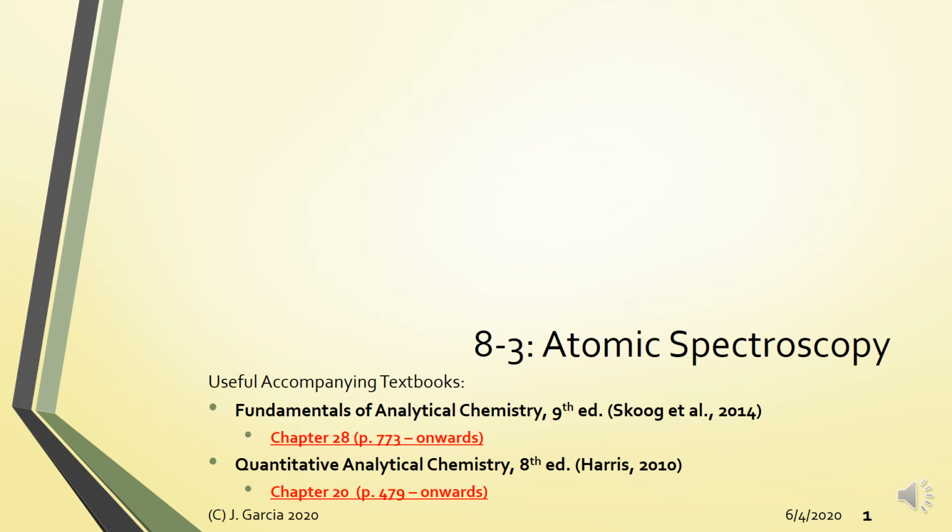Welcome again, and this is part 3 of Module 8. For this module, we will be discussing atomic spectroscopy, both the absorption and emission based techniques.